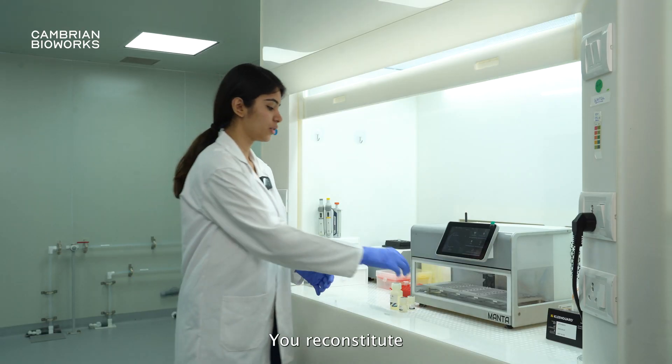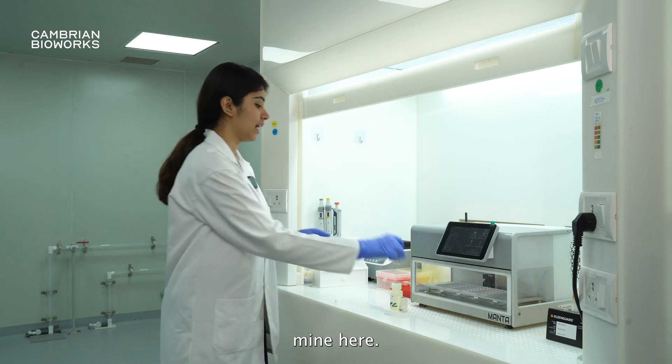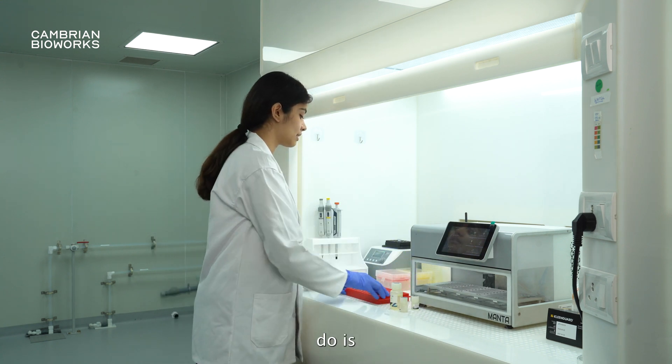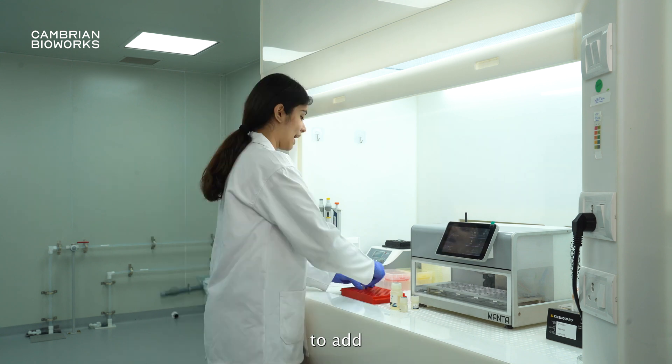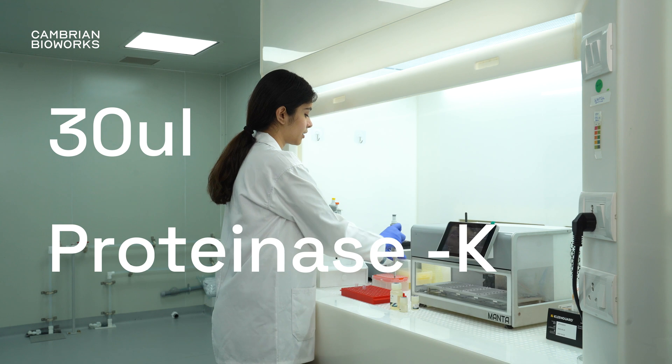So first things first, you reconstitute your Proteinase K. I have reconstituted mine here, and what you do is take a sterile microcentrifuge tube and add 30 microliters of Proteinase K into it.